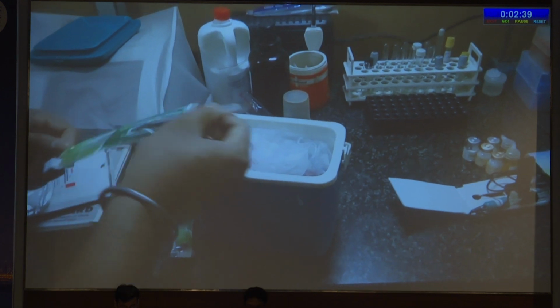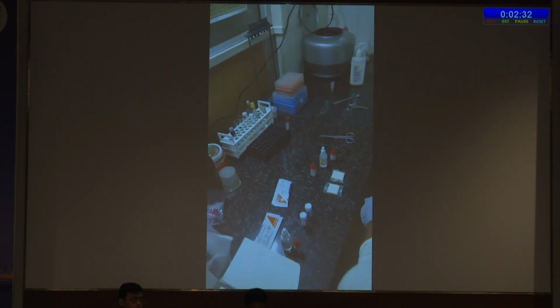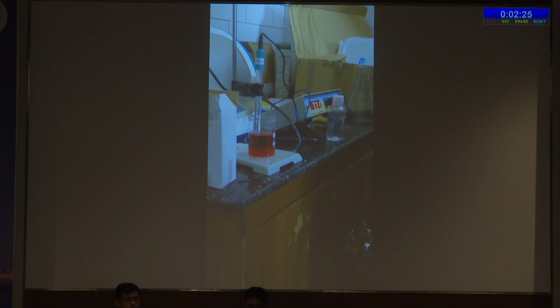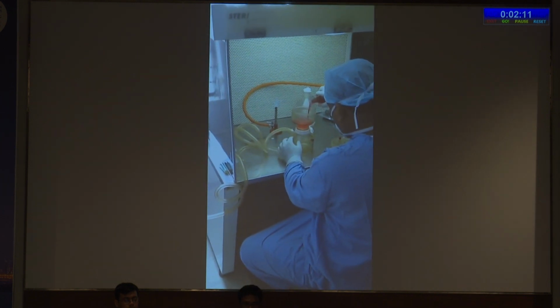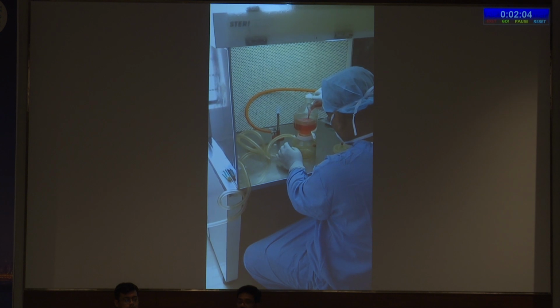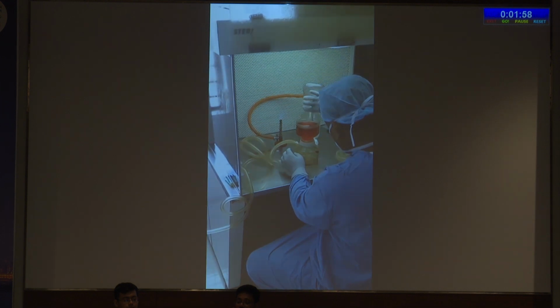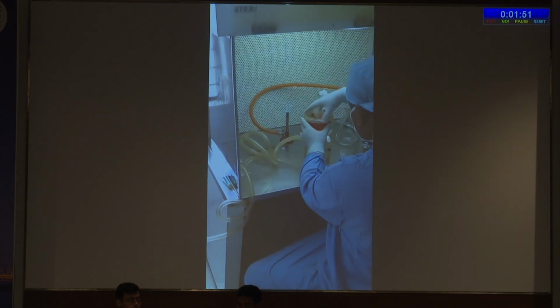So first, after getting the placenta from the OT, the cord blood is taken for the serology. Then all the components are mixed and the pH is adjusted between 7.6 to 7.8, and here the pH meter is used and titration is done. After which this thick solution, which also contains glycerine, is put in a filter. We have Whatman filter paper, 2 or 3, put in between. As this solution is quite thick, there is a suction pump with sterile tubing which helps to create a negative pressure and pulls the liquid down so that the filtration process can be smooth and quick.